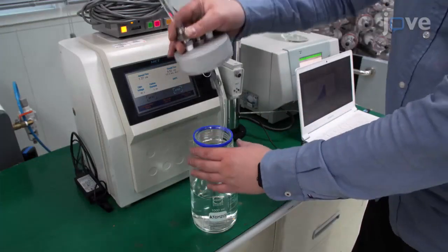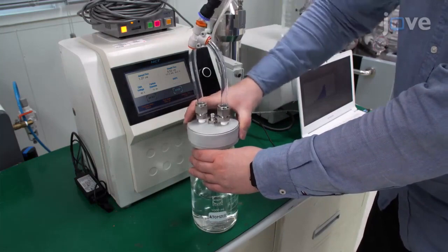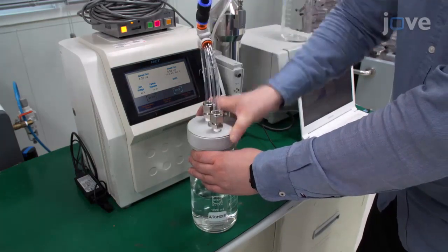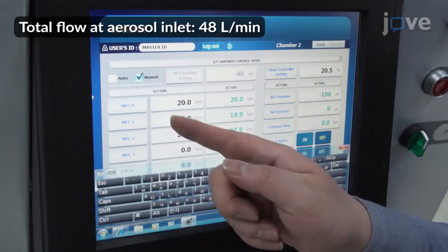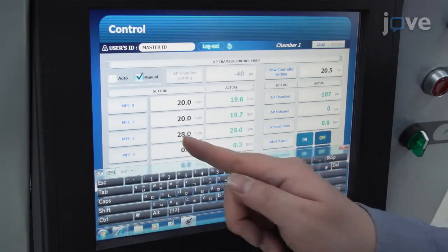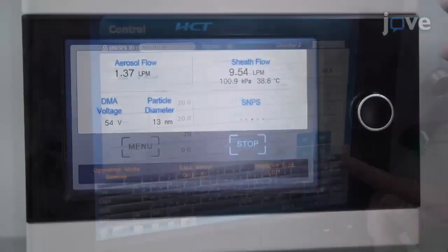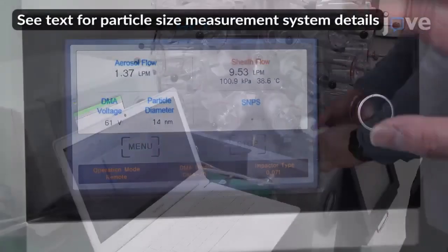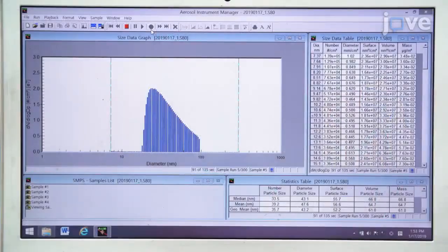Next, stop the airflow and load a 0.1% by weight sodium chloride solution into the aerosol generation system. Start aerosol generation at 20 liters per minute with clean air as the carrier gas, and dilute the aerosol with 28 liters per minute of clean air. Set up a particle size measurement system and randomly select three ports from each level of the chamber. Measure the particle size distribution at each selected port three times.